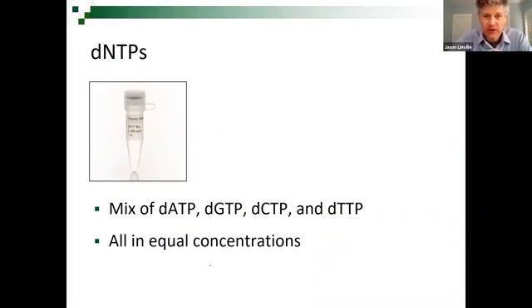Number 1, dNTPs, okay, these are the letters. To clarify, when we say dNTPs, that is the same as nucleotides, the same as the A's, G's, C's, and T's. The N is a placeholder, meaning it's a mixture of A, G, C, and T. It's basically any nucleotide. The d is for deoxy, because you could also have ribo NTP nucleotides. Nucleotide triphosphates is the thing there.